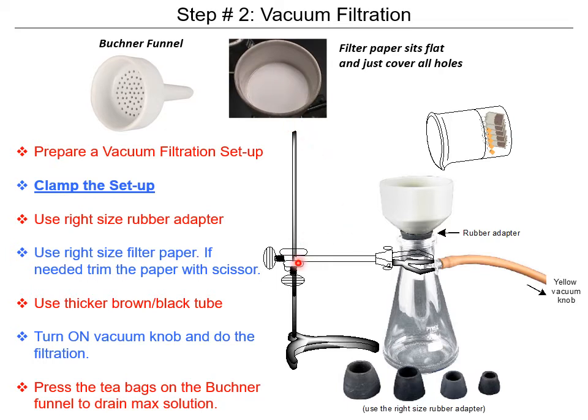Also, make sure your filter paper is the correct type of paper. One other thing to note with this step is to make sure you're using the right tube. At UTEP, this tube isn't the right one, because this will just get squeezed like a straw when you're trying to drink a thick milkshake. You want to use one of the thicker tubes with the vacuum in order to make sure that nothing gets clogged up, right? And so basically you just make sure you filter everything and collect your cellulose here, and you save this liquid down here.